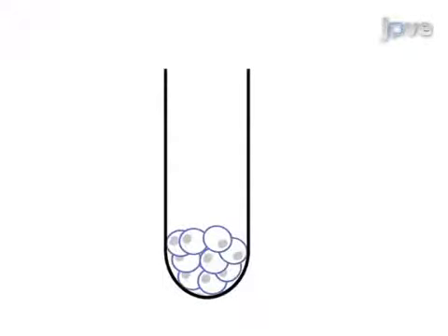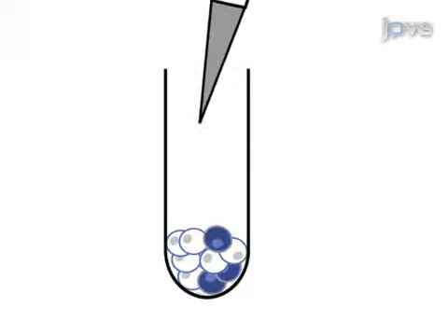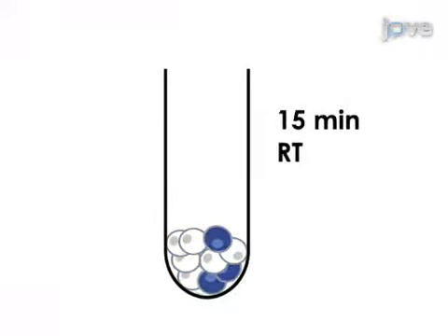The protocol for staining and fixation is described in brief here. First, the cells are washed in PBS and incubated with fixable dead cell staining solution. After another wash step, the cells are fixed in paraformaldehyde, following which the cells can be treated without adenovirus biosafety precautions.